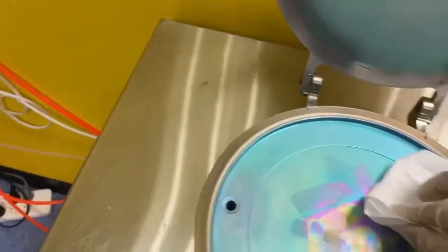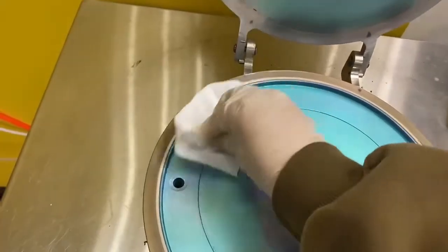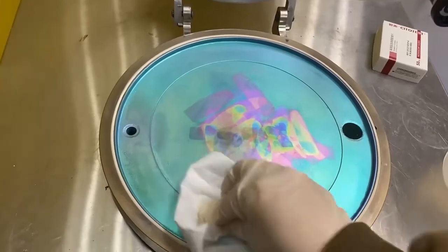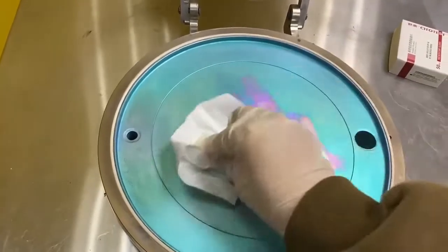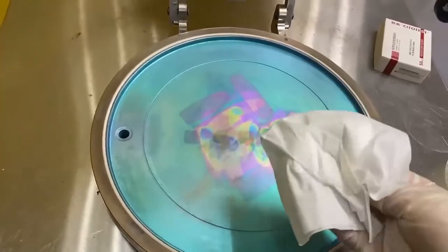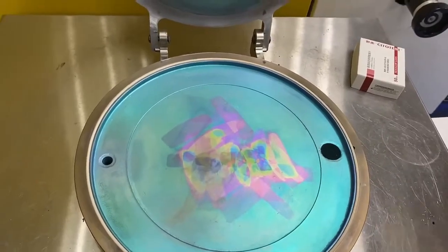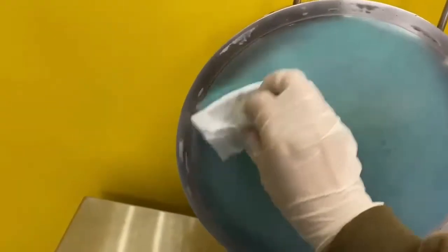Then clean the whole chamber slightly, including the bottom and the top of the lid, with IPA solution and lint-free tissue, so that we can remove some unreacted precursors stuck on the surface of the chamber.